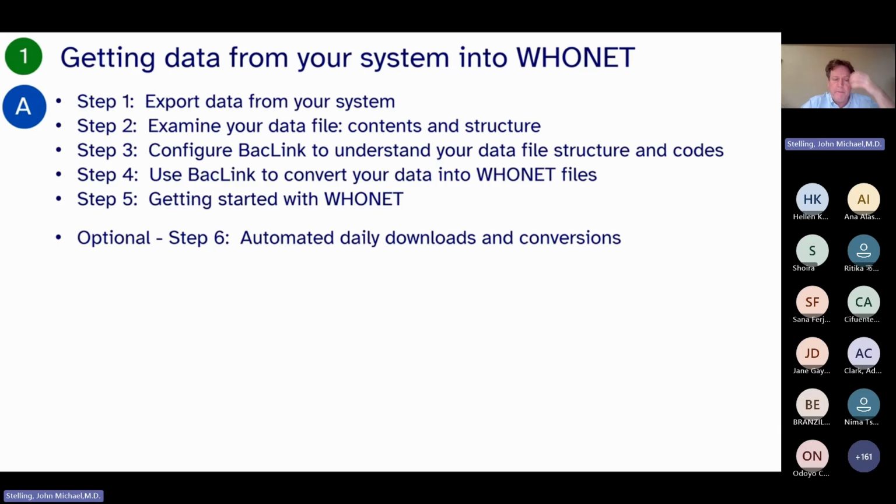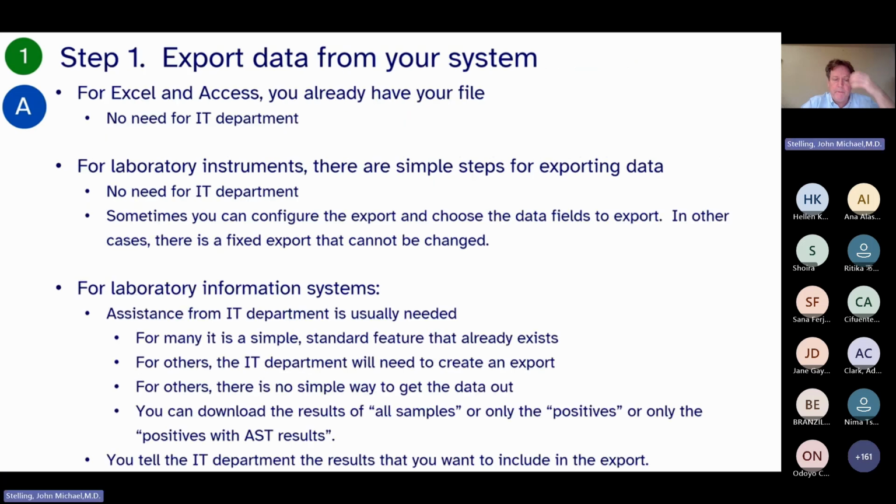Step number 6, you have the ability to schedule this. Schedule it for daily or weekly or monthly. Those are the 3 I would generally recommend. Of course, you can do whatever you want, but those 3 make the most sense. So we'll go through each of these 6 steps, and then I will proceed with a live demonstration.